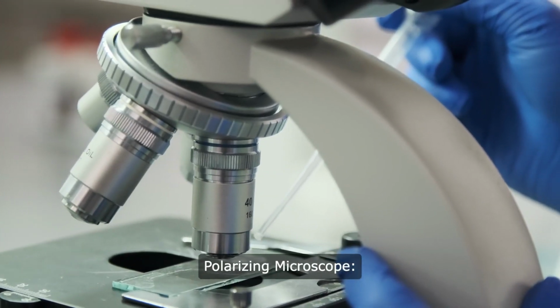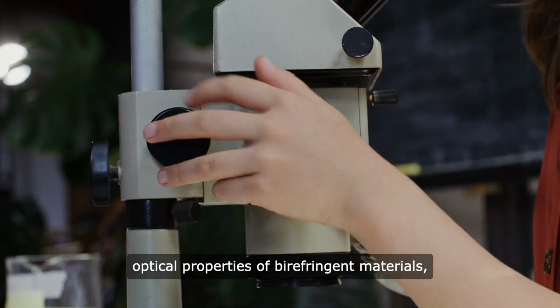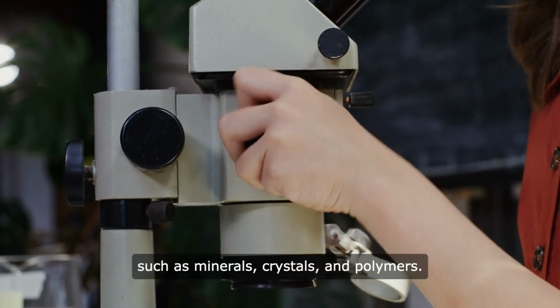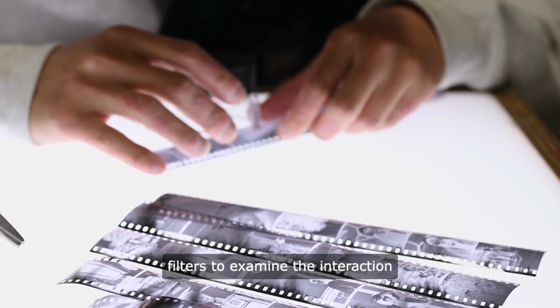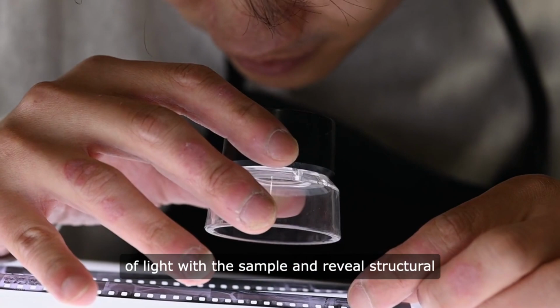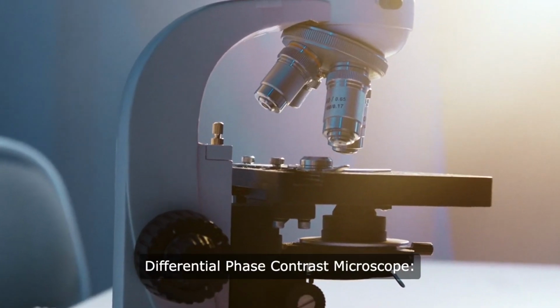Polarizing microscope. Polarizing microscopy is used to analyze the optical properties of birefringent materials, such as minerals, crystals, and polymers. It uses polarized light and polarizing filters to examine the interaction of light with the sample and reveal structural and compositional information. Differential phase contrast microscope.